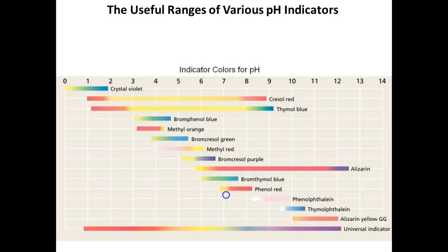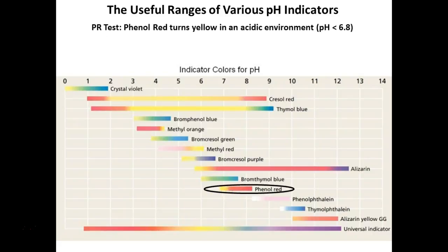Would you expect a methyl red positive organism to be phenol red positive? So methyl red is what? 4.4. So it's at 4.4 or lower. So therefore, if we looked at phenol red, should it be yellow? Yeah, look, way over here. If it's anywhere 6.8 or below, your phenol red is also going to be yellow, which indicates it's acidic. Still with me?